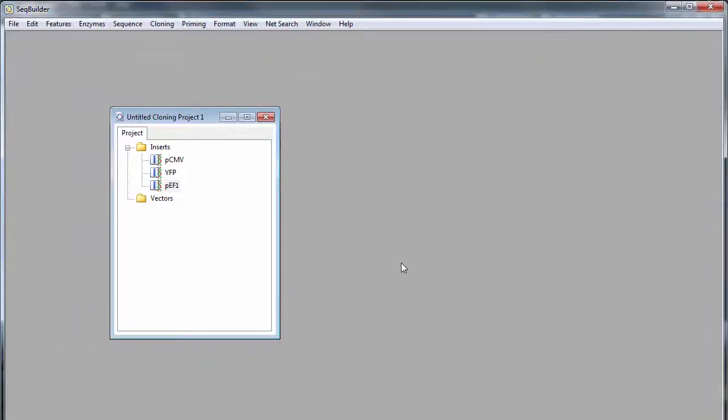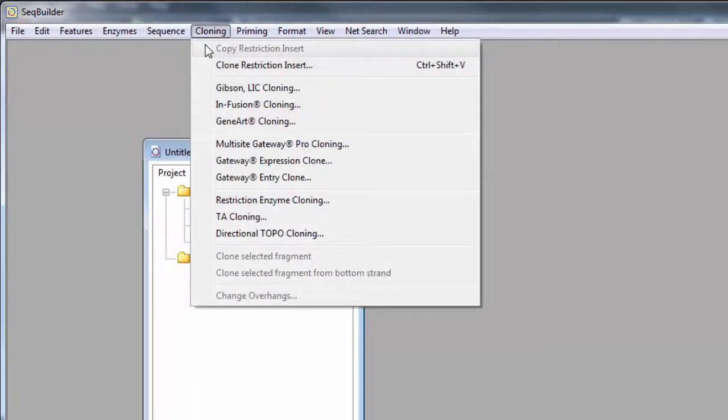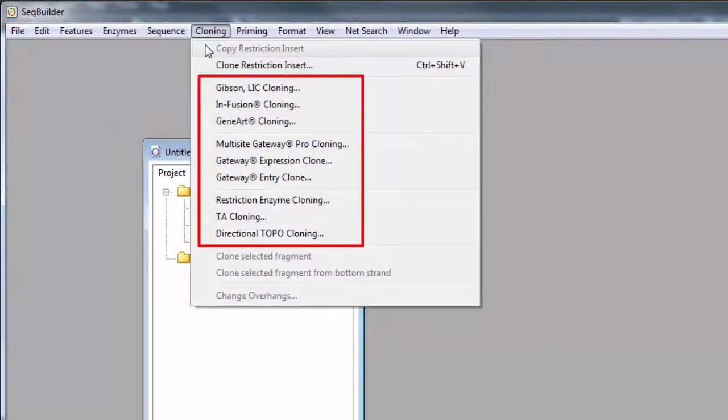Next, select the cloning method you'd like to use from the Cloning menu. SeqBuilder offers several cloning methods, including Gibson, Infusion, GeneArt, Gateway Multisite, TA, Topo, and Restriction Cloning.